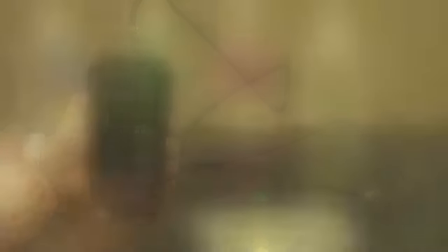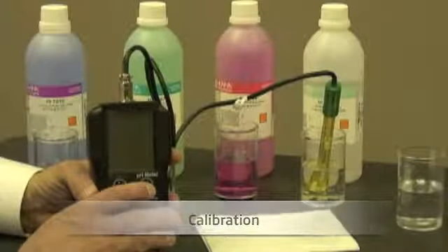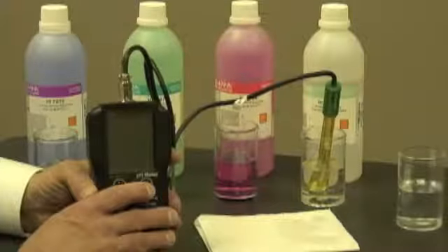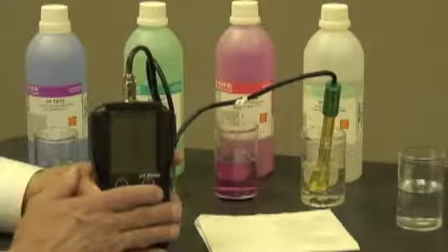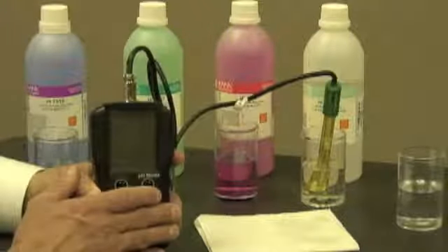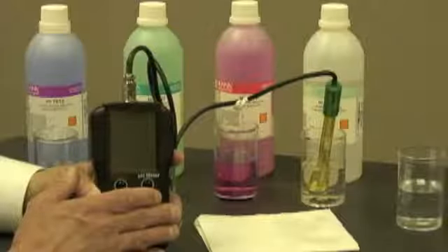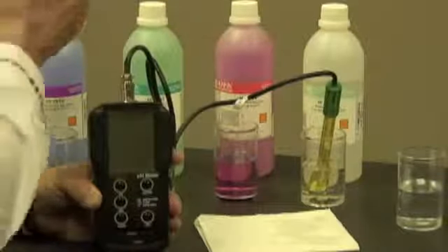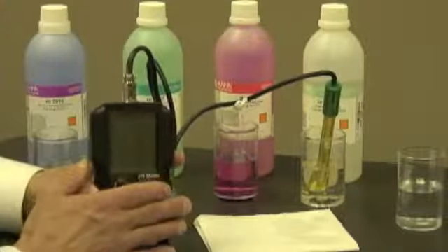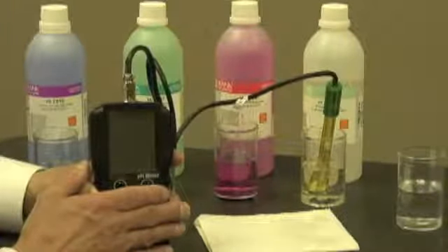Let's use the meter. Before using a new probe for the first time, it's very important to condition it first. As you can see here, I've taken the liberty of putting the probe into a storage solution — in this case, it's HI70300. If you don't have a storage solution, that's okay; you can put it in a buffer as well. I'm going to leave this in the storage solution for approximately two hours.